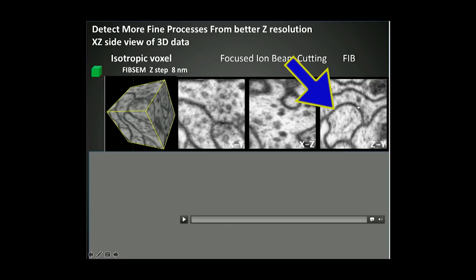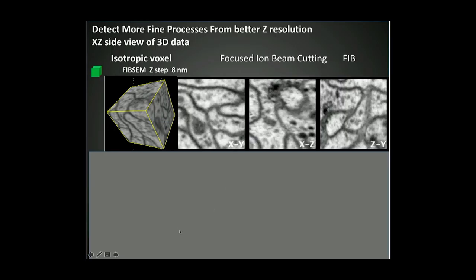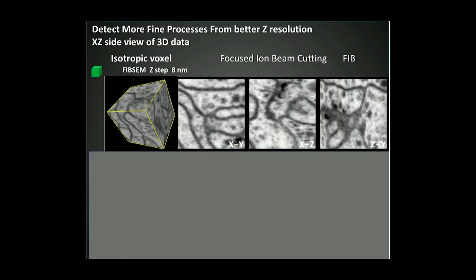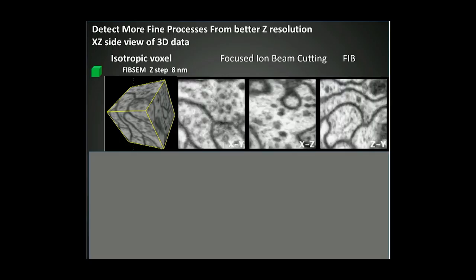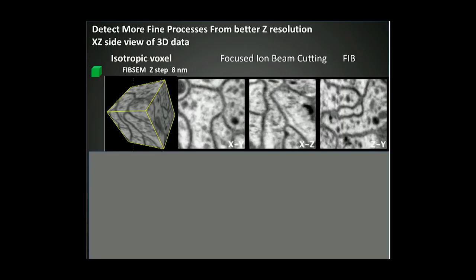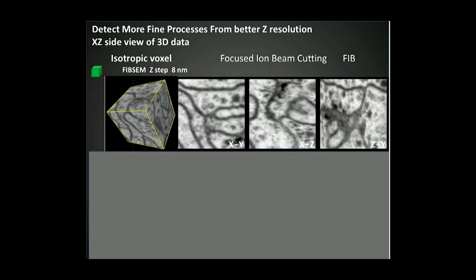So this here is the outline of one of these synapses. The black part is actually the membrane itself. So what you saw, time here is moving in Z, and you'll see on the left picture right there, the dark spots, those are actually the synapses. They're pretty small. And this is a typical fan-in circuit. There are multiple synapses going all onto one dendrite. And you see the opposite in the fly, fan-ins, fan-outs. There are just a variety of structures that are all visible. It's more complex than it is for a mammalian brain.